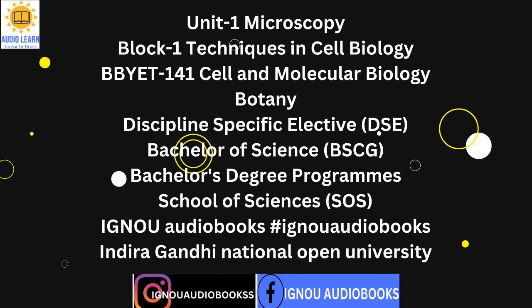Box 1.3: Abbe theory of image formation in a microscope. The modern theory of image formation in the microscope was given by German physicist Ernst Abbe in 1873. According to this theory, convergent light obtained from a condenser helps in visualization of objects or specimens in the focal plane of the microscope. A collection of plane waves propagating in a specified set of directions is called convergent light. The superimposition of waves produces incident illumination.